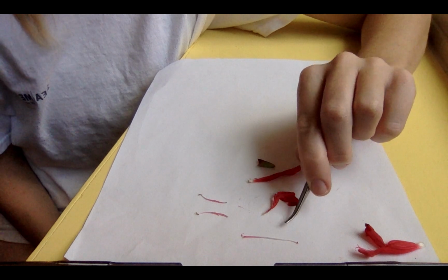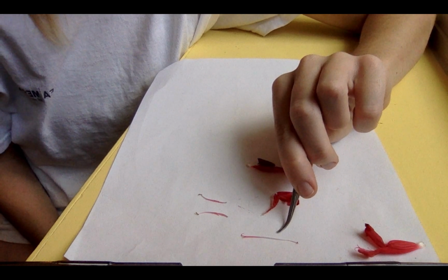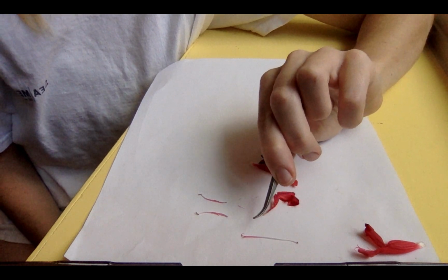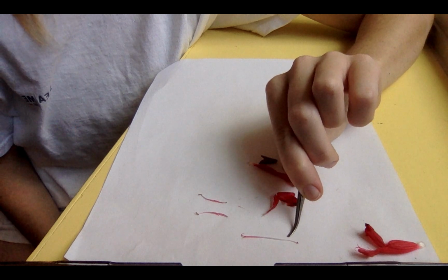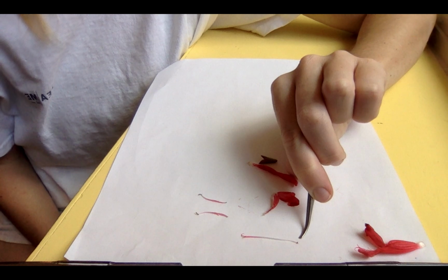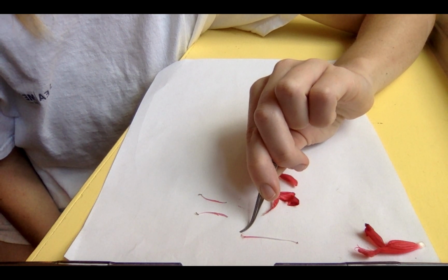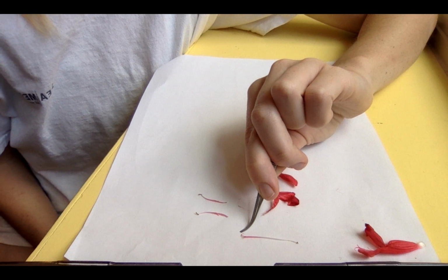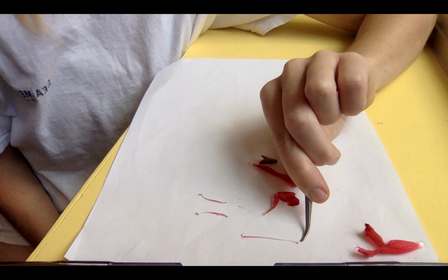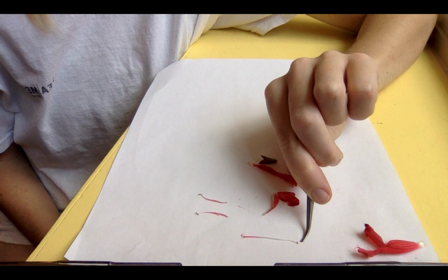And so then when we look at the carpel, or sometimes called pistil, which is the female reproductive system, this stalk-like structure is the style, which connects the stigma to the ovary. And the stigma is a sticky platform, which is where pollen is taken in to the ovary. Now the ovary is what houses the female gametes, which are the ovules.